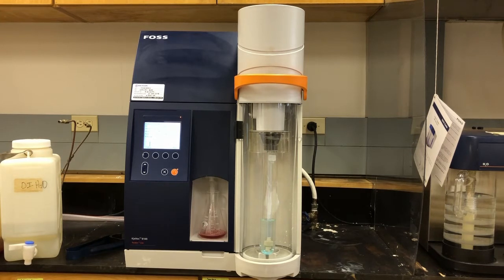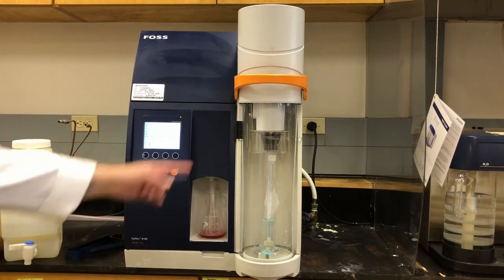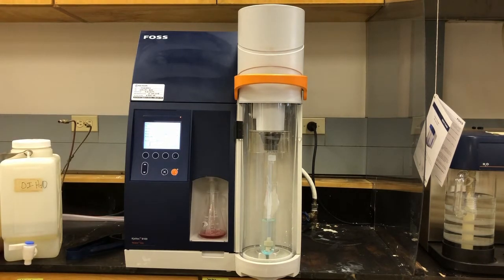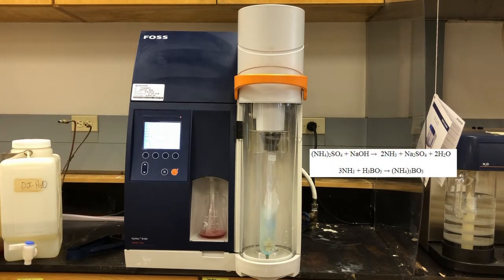Once we have our sample and our receiving flask in, we can press start. And you should see fairly soon here now the alkali being dispensed into the tube. So the alkali in this case is sodium hydroxide. There you go. So that's dispensed in the tube. And you can see that that's a fairly vigorous reaction because it's a concentrated base reacting with a concentrated acid. Remember the sulfuric acid that's in our tube.